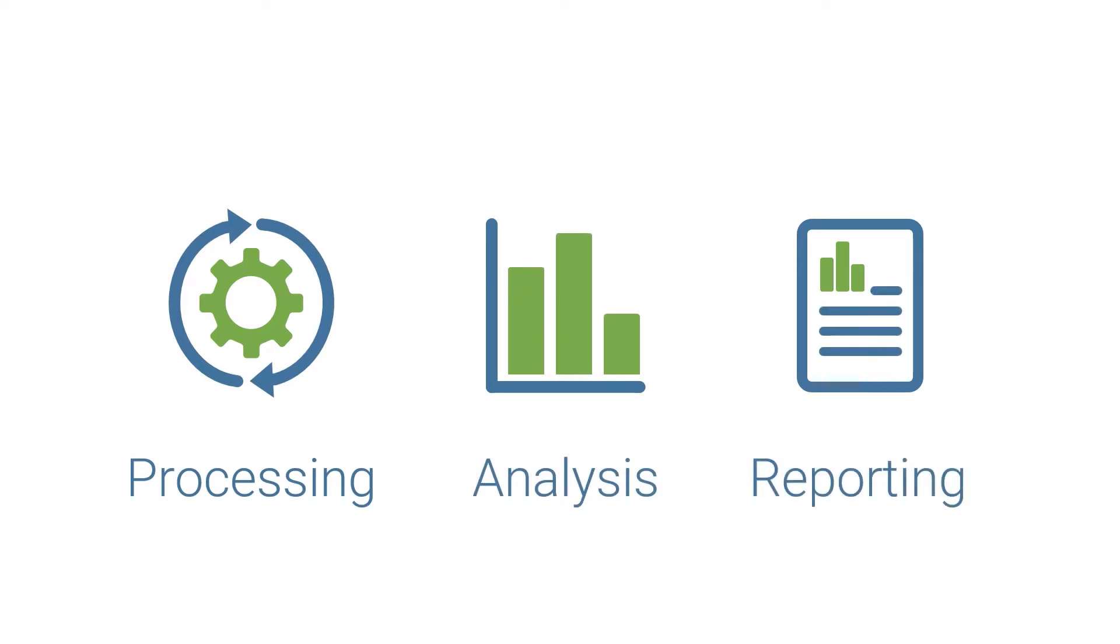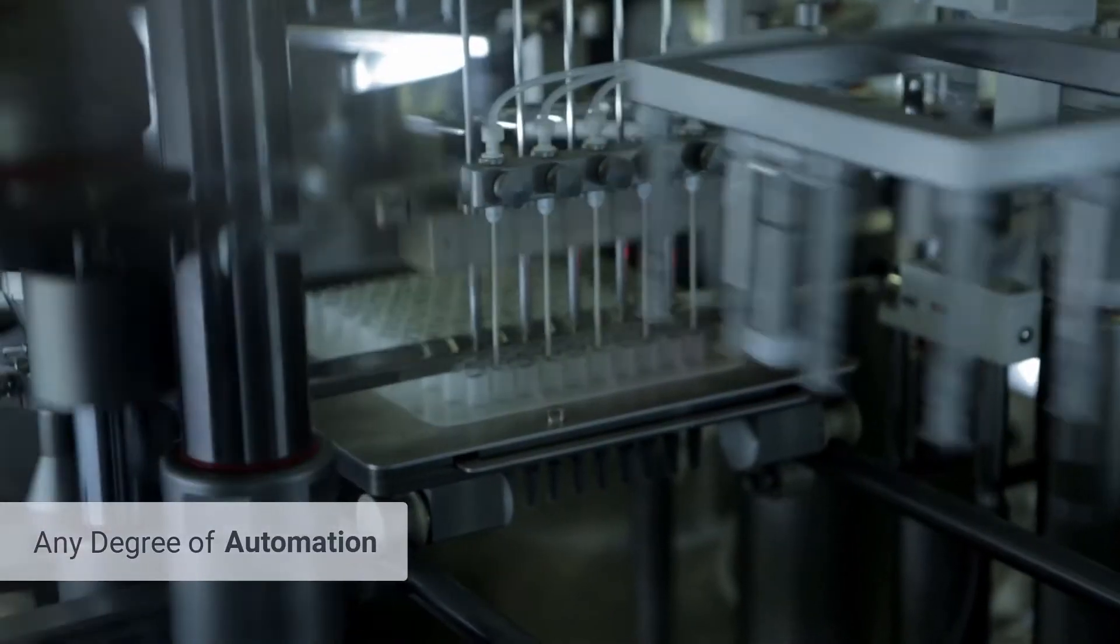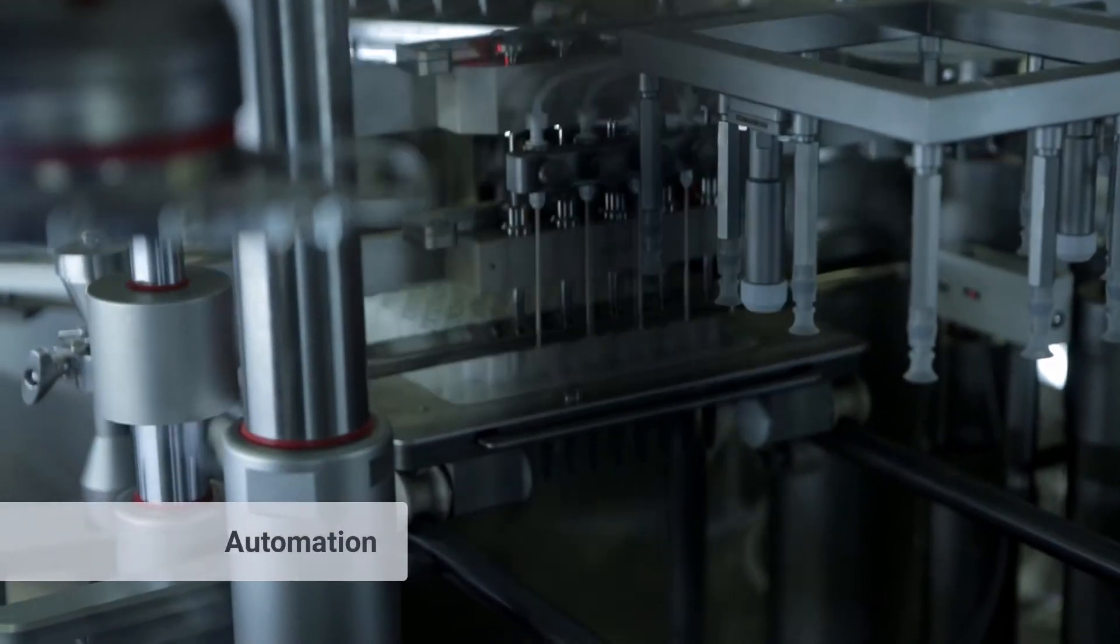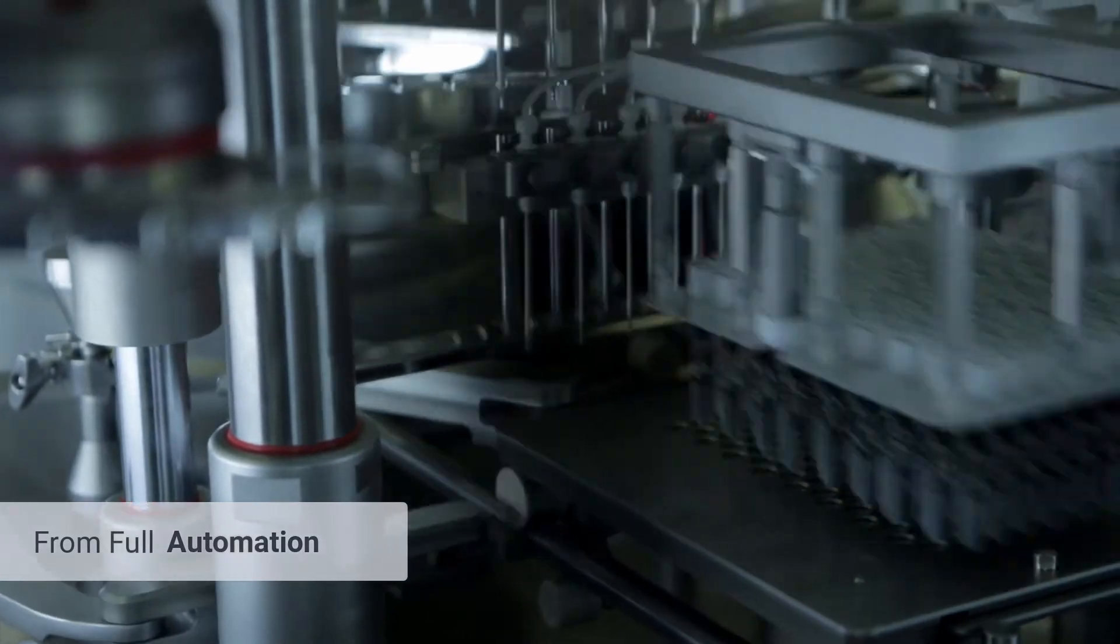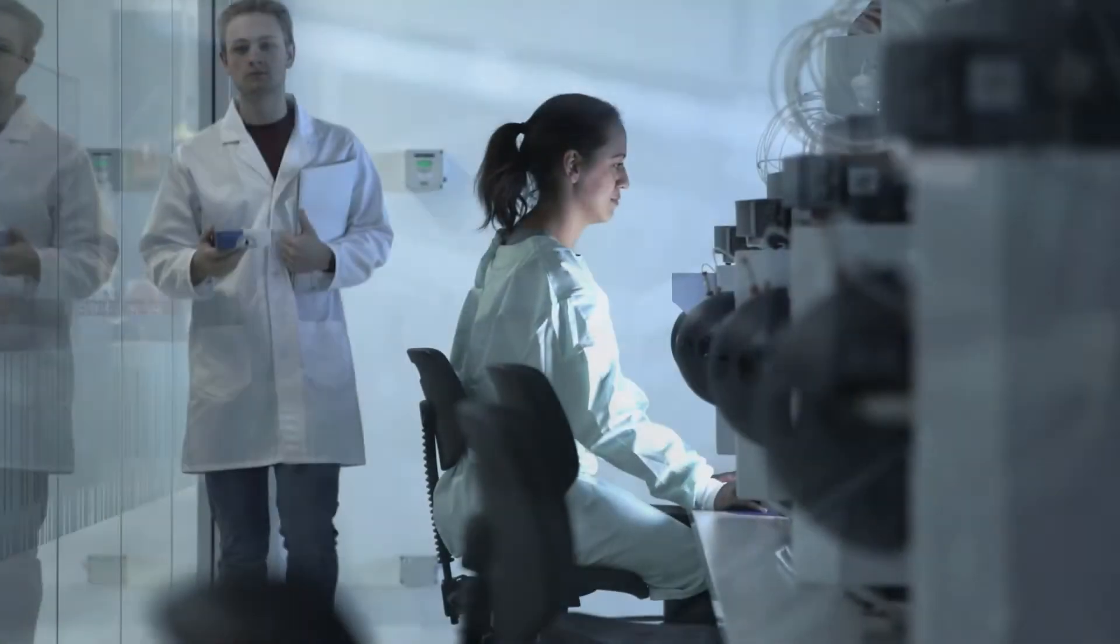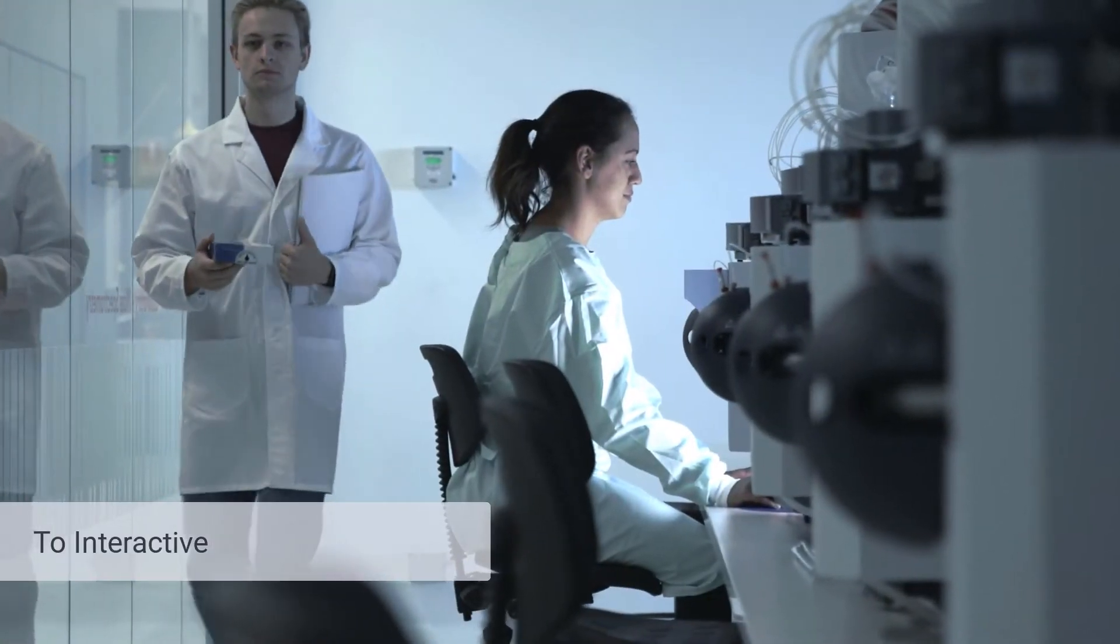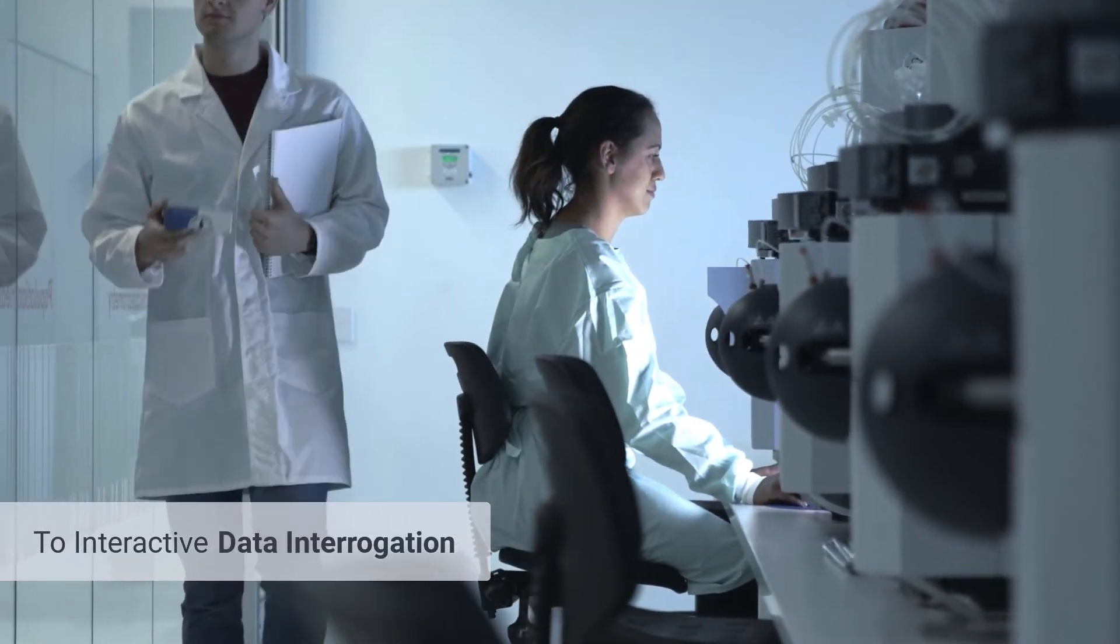This flexible workflow approach enables any degree of automation, from fully automated intelligent batch processing to user-driven, interactive, in-depth data interrogation.